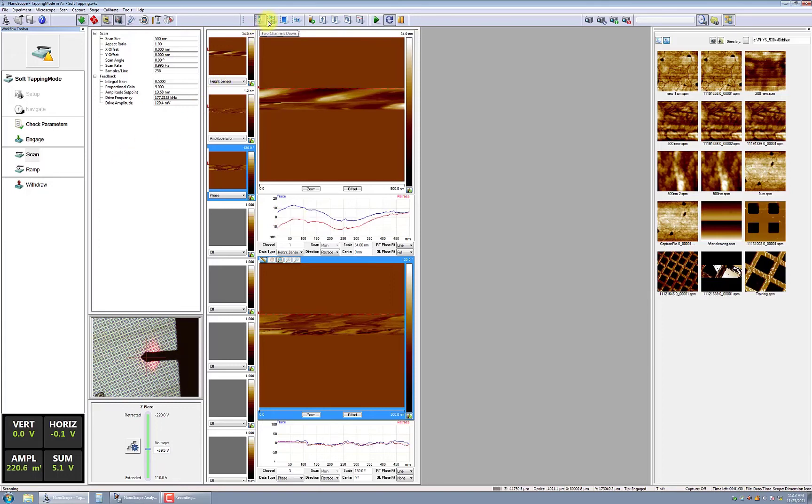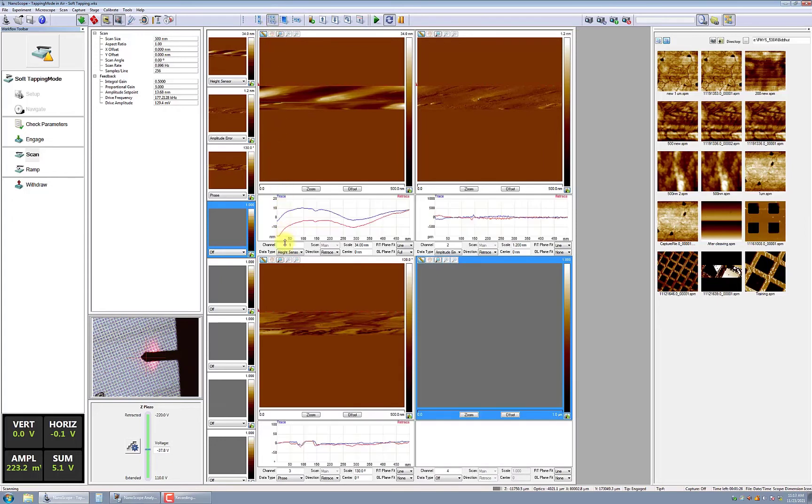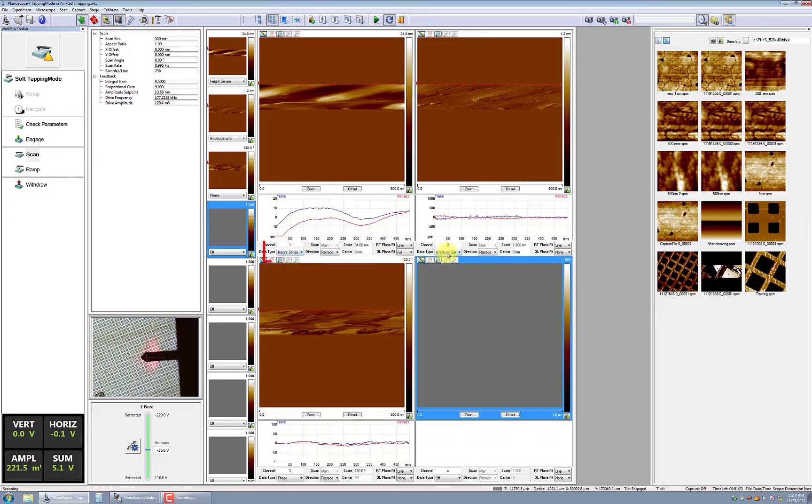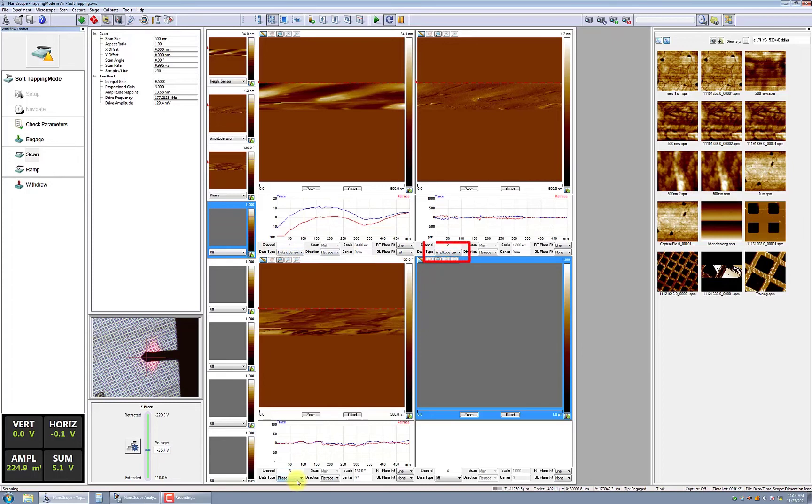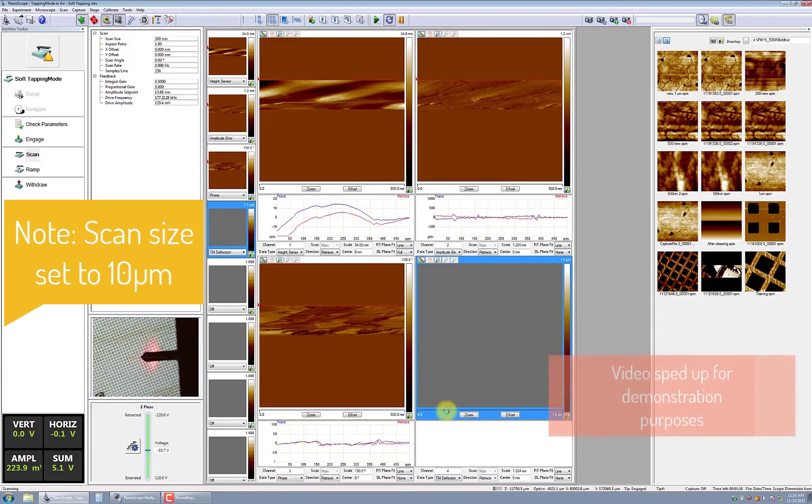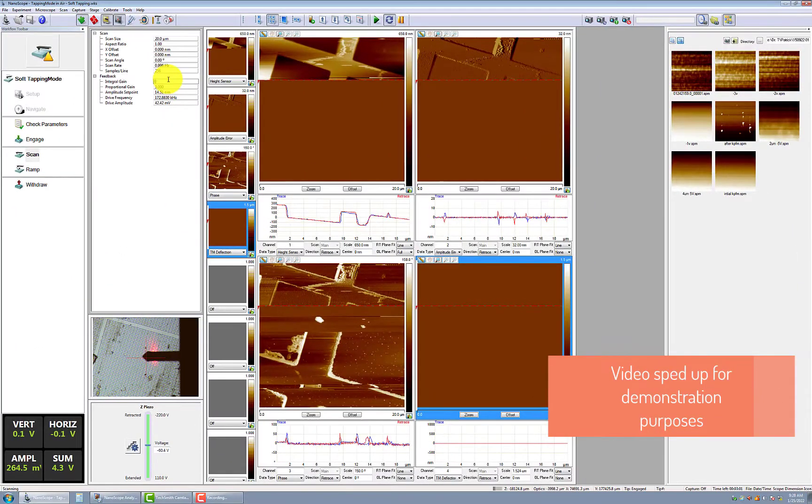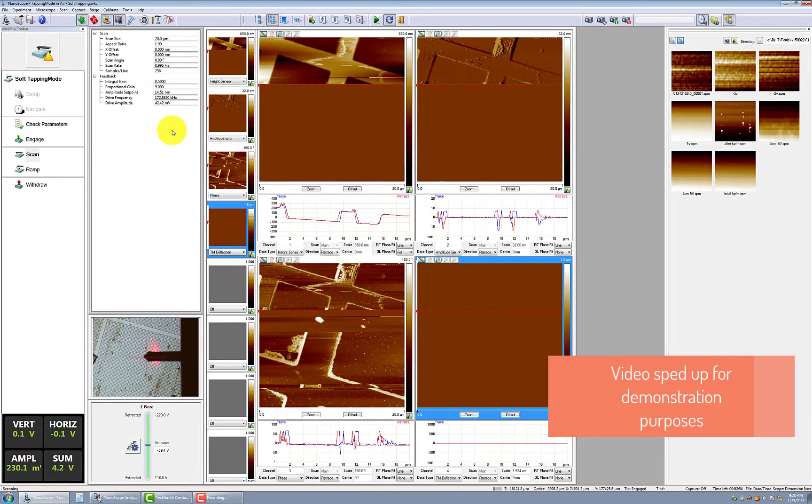Next, you will need to configure your workspace to show the following four suggested channels: Height sensor, amplitude error, phase, and TM deflection, or your choice. The trace and retrace should completely overlap, as shown in the height sensor.